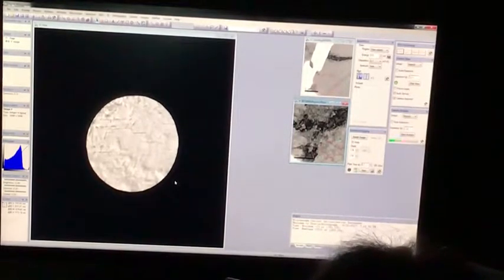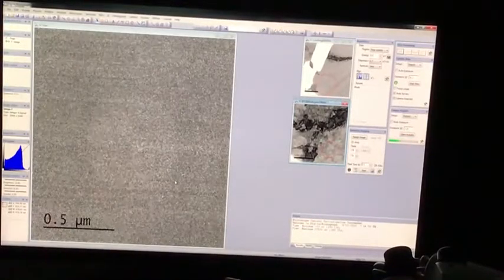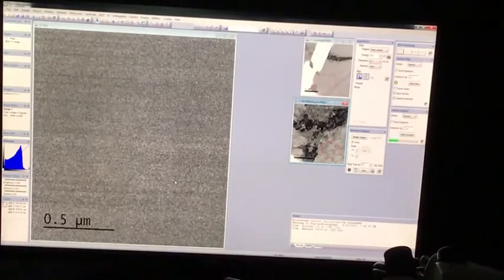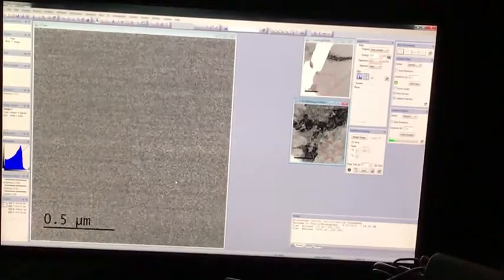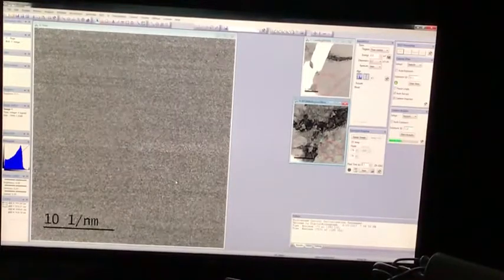and I'm going to lower the screen and set up a diffraction pattern so that we can see this without blowing up the detector. So that's really quite critical. What we want to do is get it nicely set up for imaging. So we need to be on the nearest zone axis, which is where we're at. Diffraction mode.